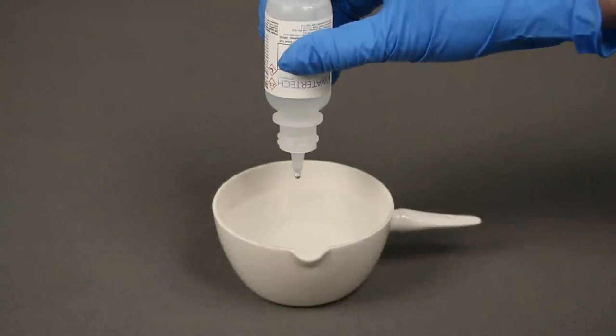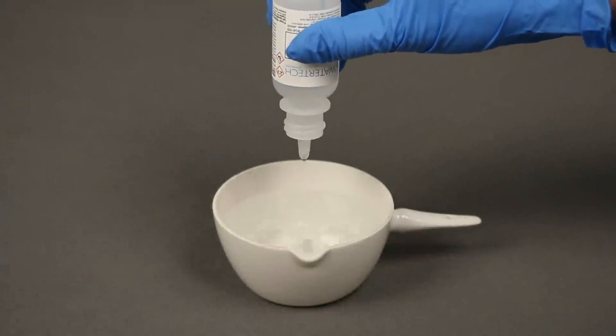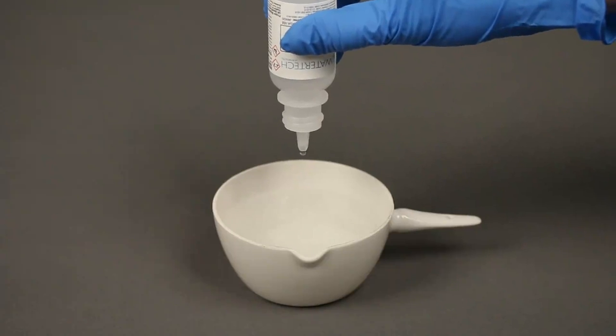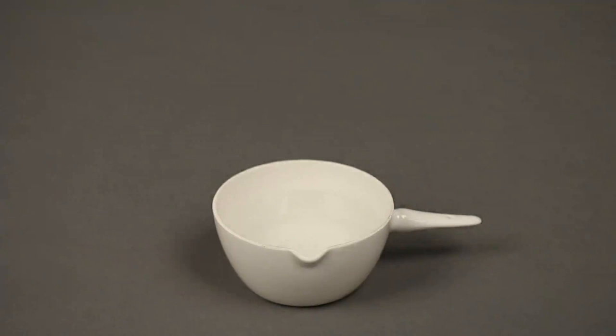Next, add five drops of hardness buffer solution. Hold the bottle vertically for a consistent drop size. Stir to mix.